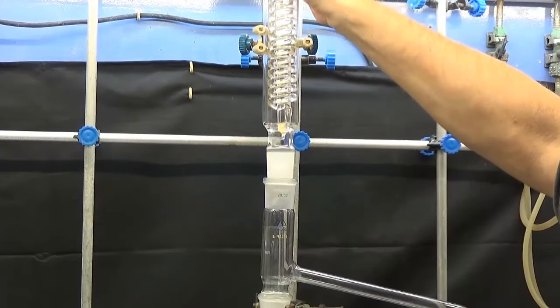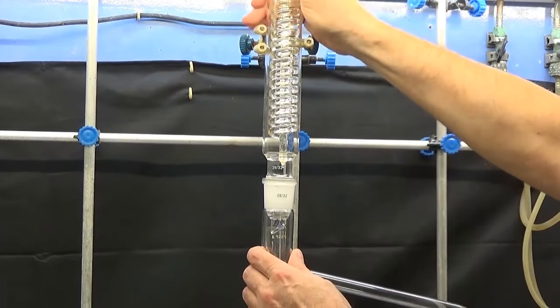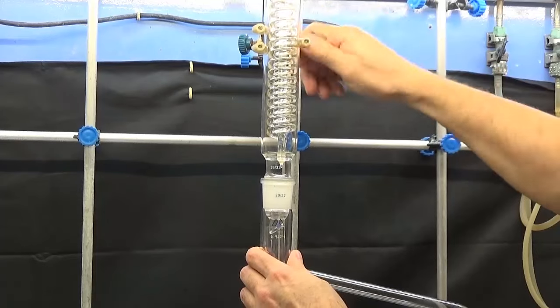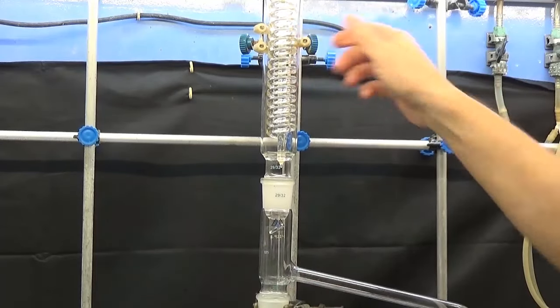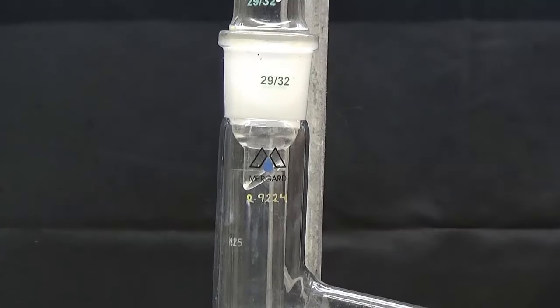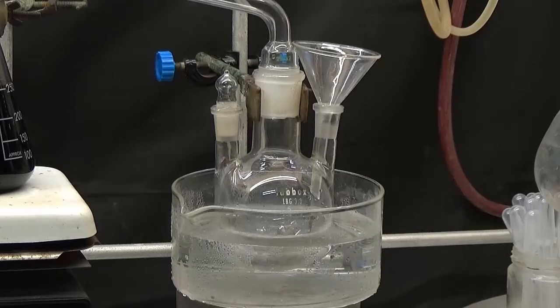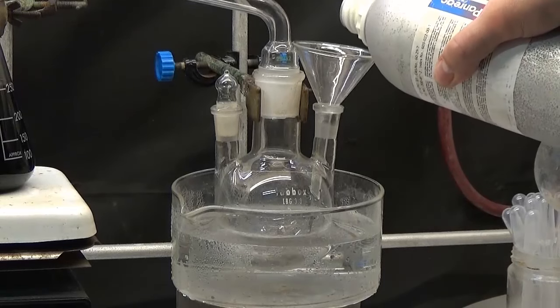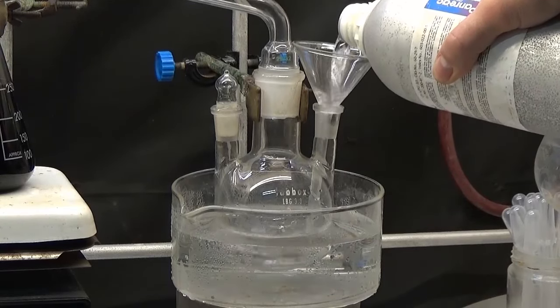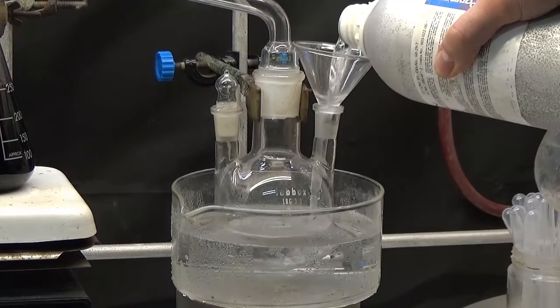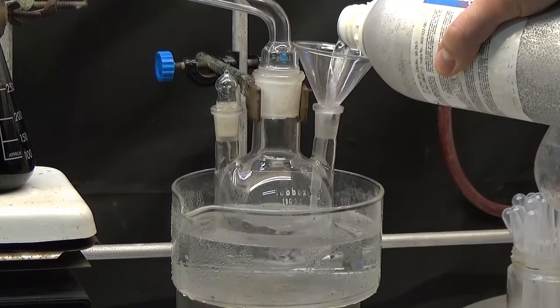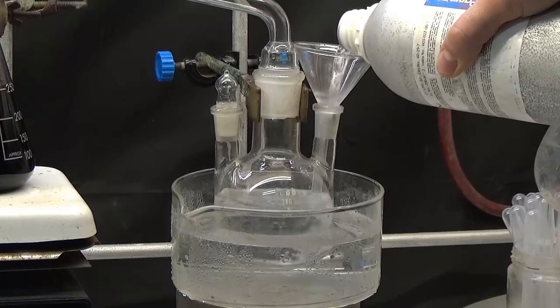We adjust the condenser. It's important that the condensed ether falls in the center funnel. Put the evaporation 250 milliliter flask in a warm water bath. Fill the evaporation flask with 200 milliliters of ether.